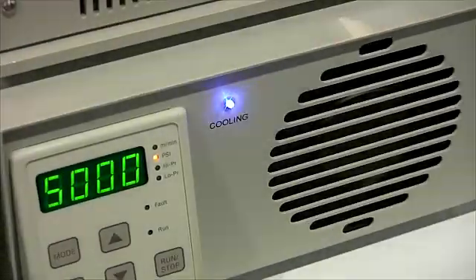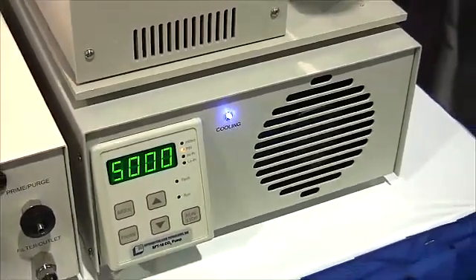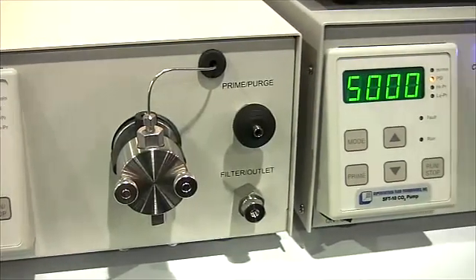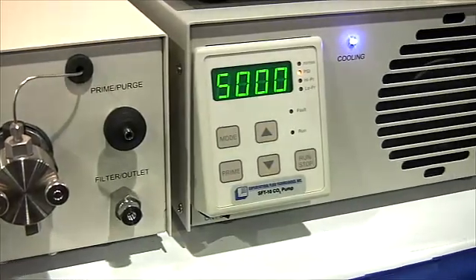The SFT110 is used by research scientists and process development engineers around the world. The easy to use features, wide range of applications, and low maintenance costs have made the SFT110 very popular with universities, research institutions, and industry.